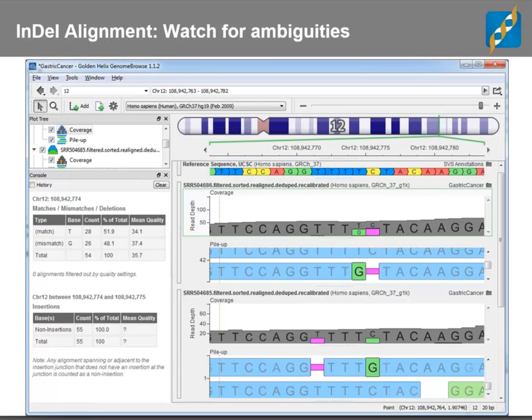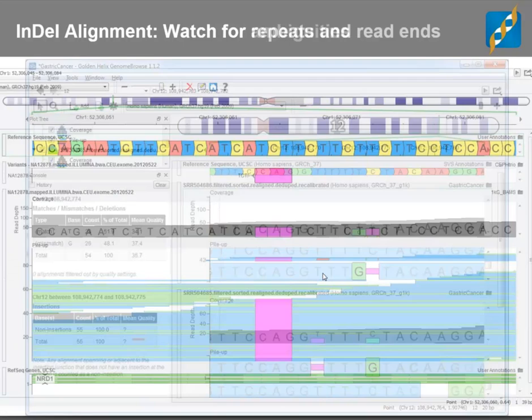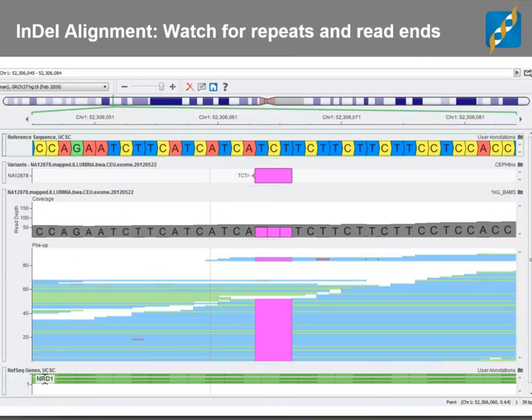This could be based on a number of reasons, but is it the alignment algorithm's fault, or do you have to have another tool that takes this all into account and aligns them? This was actually already locally realigned. So in fact, all of the reads, there's about 25 of them, have a consensus on them being placed in this position versus this position, but ultimately it's still the same haplotype. So it's bigger than just getting them to agree between individual reads. You have to start to look at a larger class of problem.